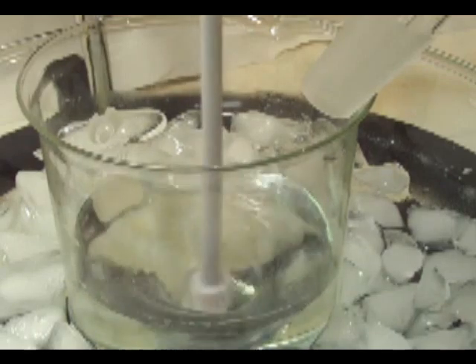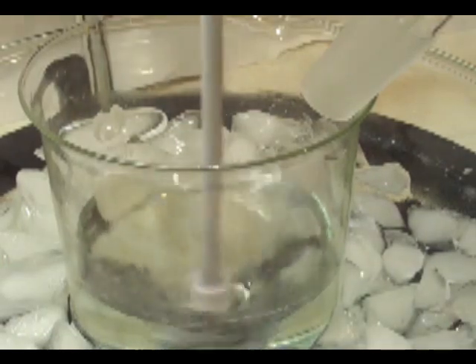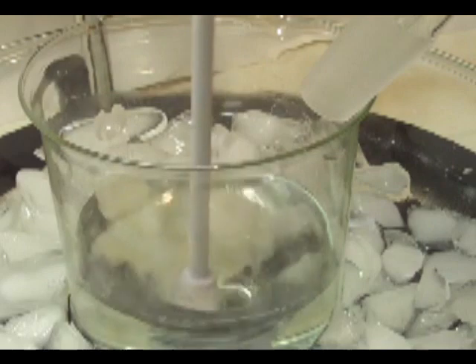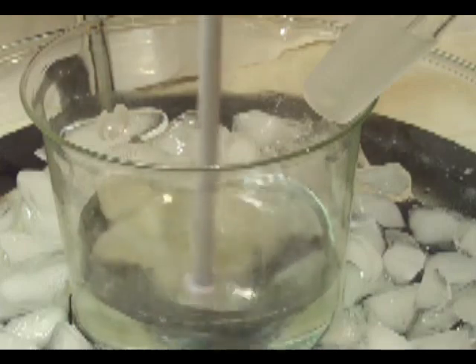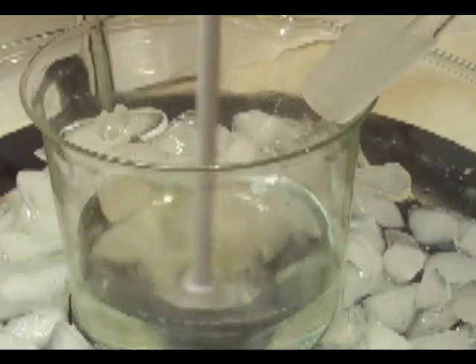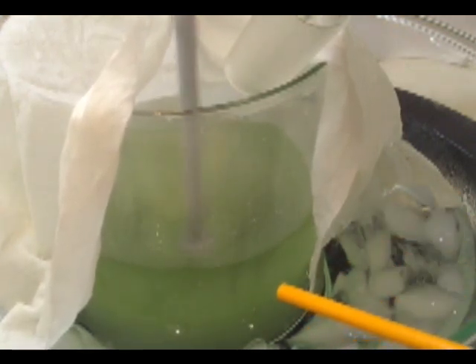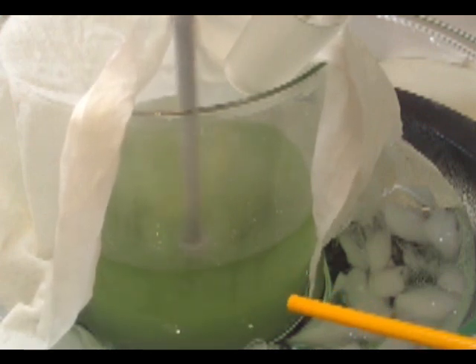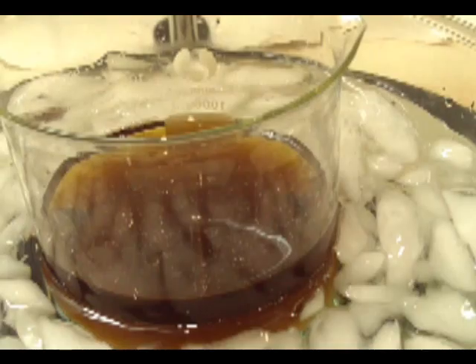We're going to begin drip-wise adding in our sulfuric acid. Please be careful as splashes can be very dangerous. It went a little bit too crazy at first getting it going, and it involves some gas. You want just a very slow drip. It took about four hours to drip all of it in. Here it is about an hour and a half in. You can tell at the bottom that there's a precipitate forming. This precipitate is potassium bisulfate.